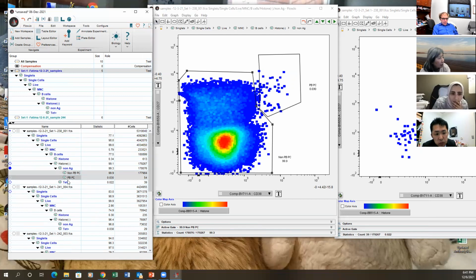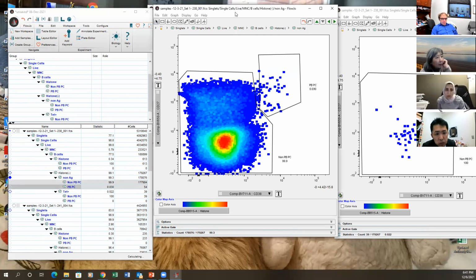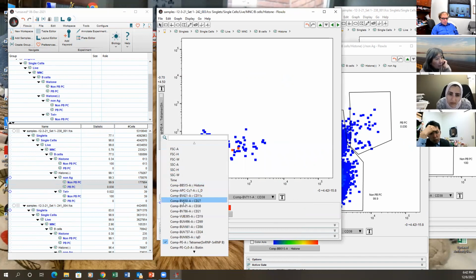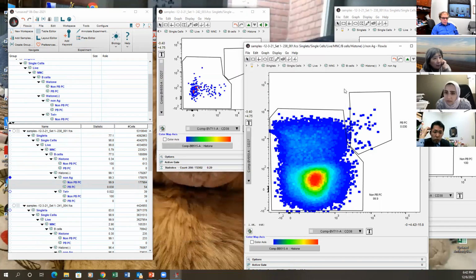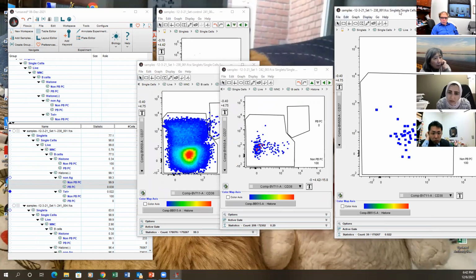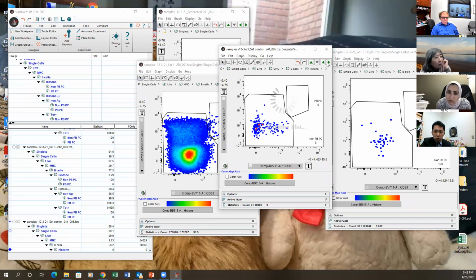Now, this is it right here. This thing. And you could really do all three histone. You do a histone like that. So we can look at histone. It's already there, so let me make this smaller so we can see all three together. Well, this is not the same individual. Let me go to the same person.